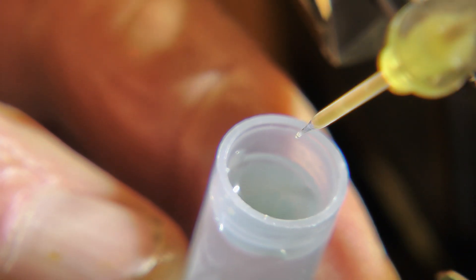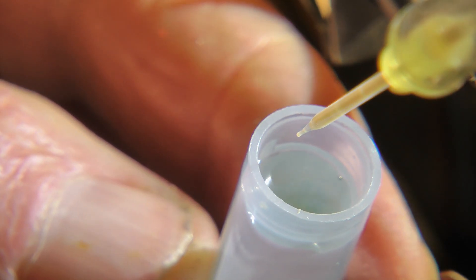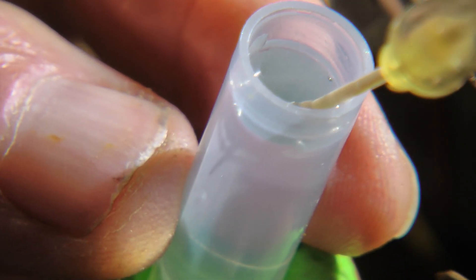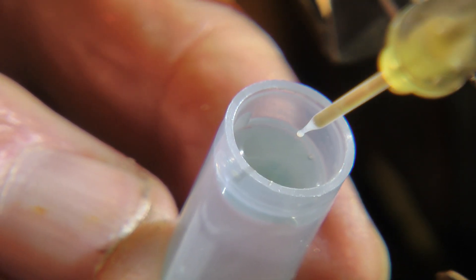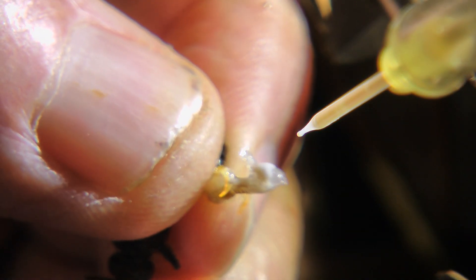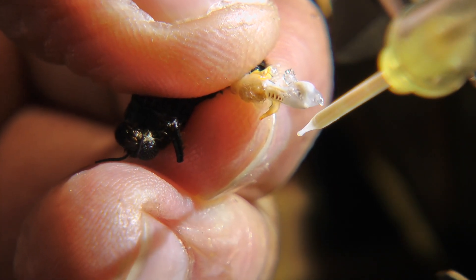Every few drones, Bill uses some buffered saline to keep the syringe tip open and to place a marker in the semen column. Then he uses a ruler to measure how much he has. Looks like he's got 40 microliters. He wants about 10 microliters for each queen.